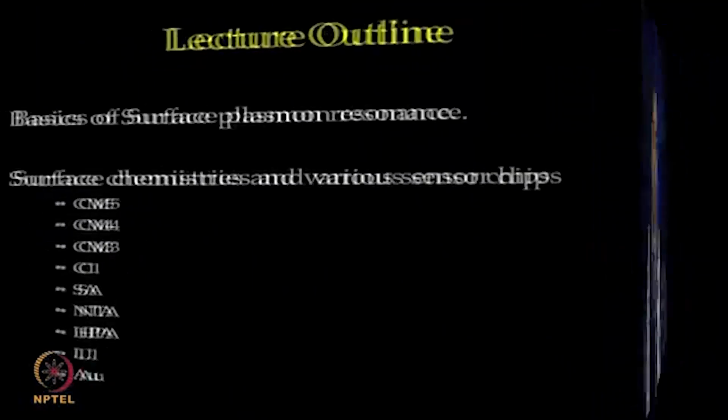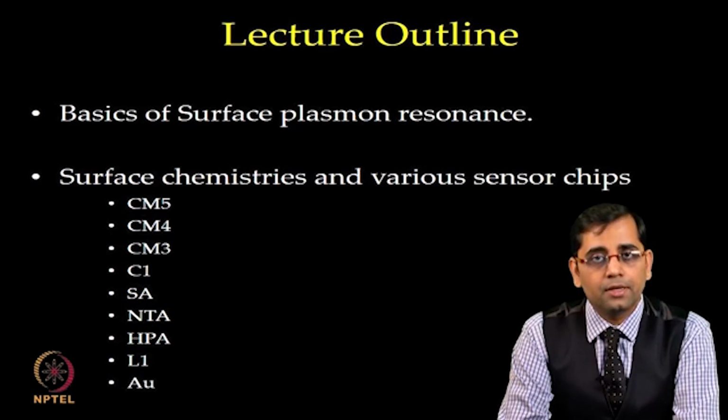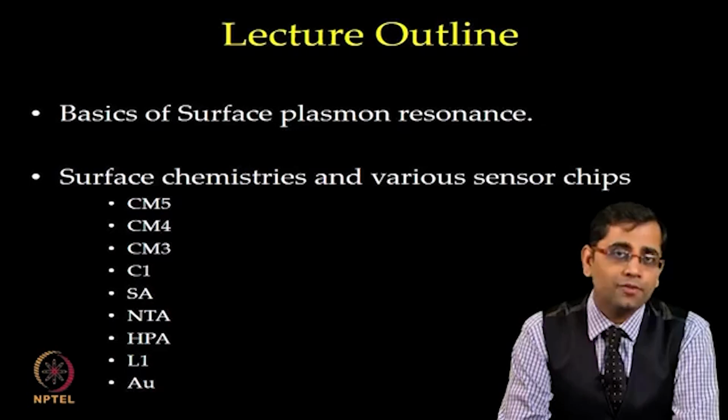Welcome to MOOC NPTEL course on Interactomics. Today we are going to talk about basics of surface plasmon resonance (SPR) with focus on surface chemistry.